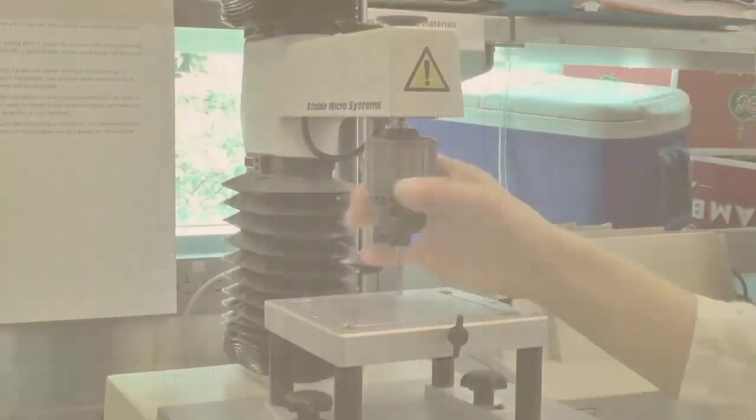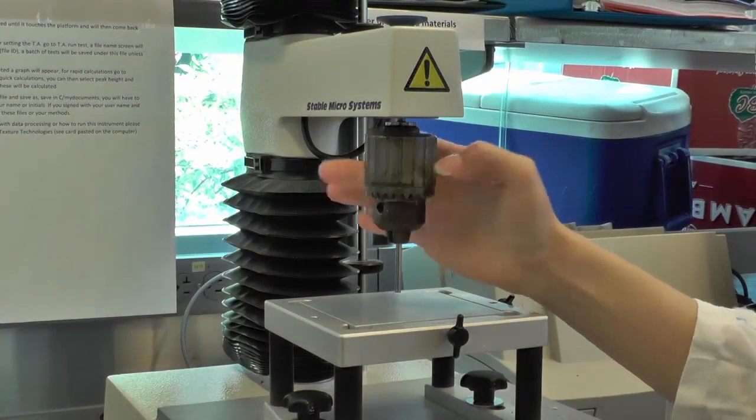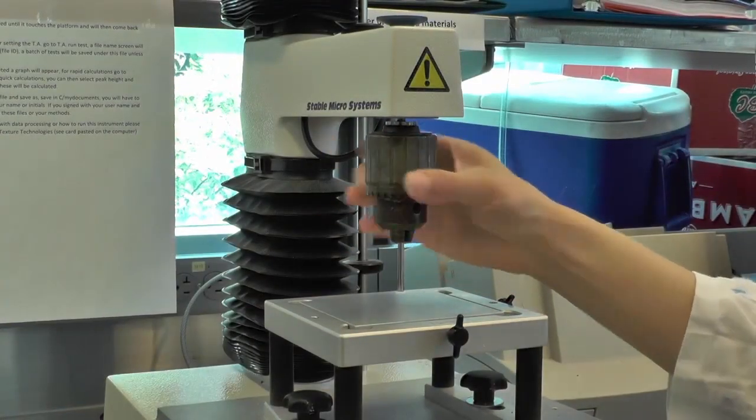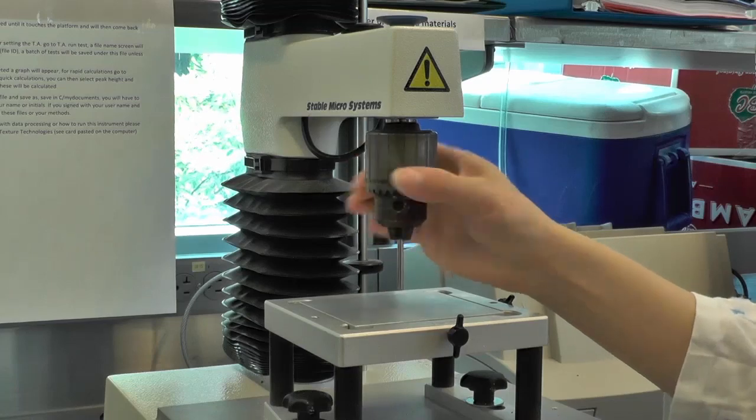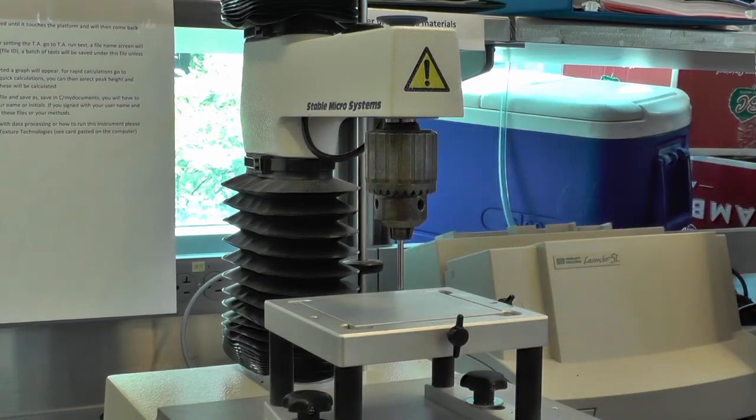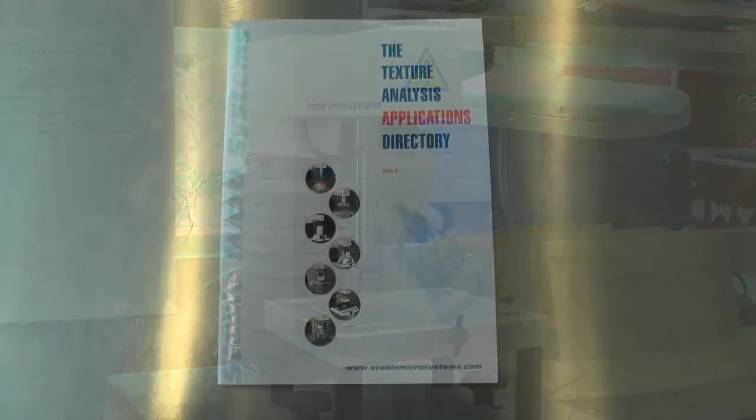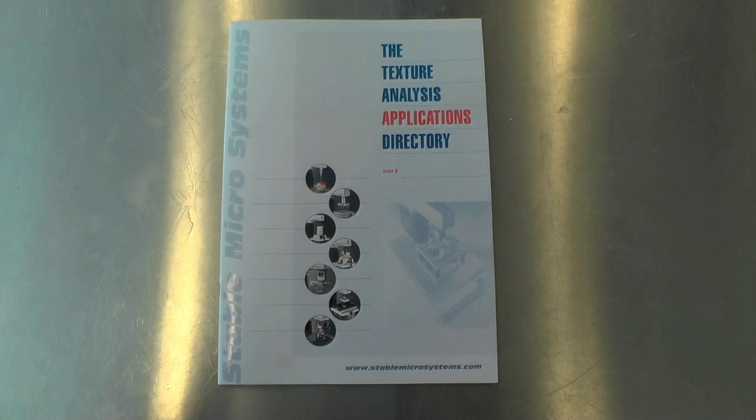Before you start testing, you need to first calibrate the instrument. To do this, attach the probe that you would like to use for your experiment, and then start the calibration. Information on the features of different probes can be found in the Texture Analysis Applications directory.